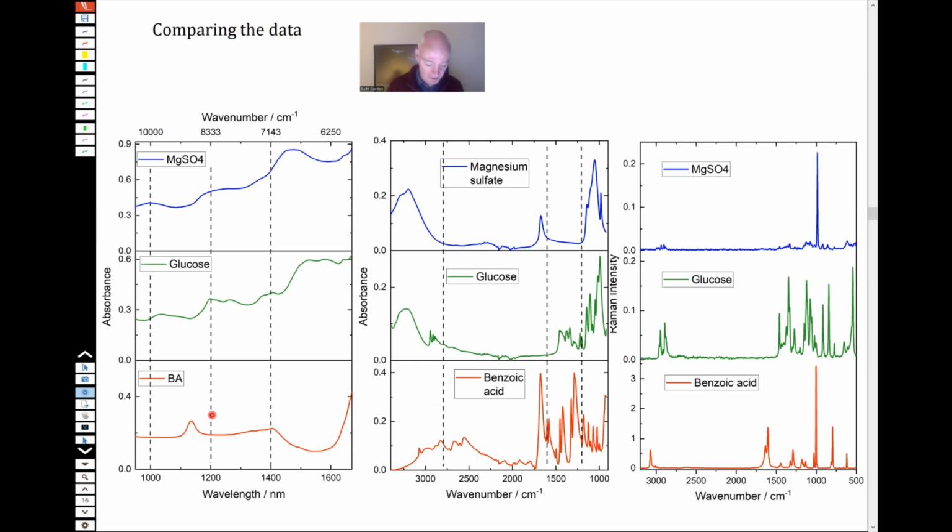So you're using a near-infrared measurement mode, an infrared measurement mode, and a Raman measurement mode. And they allow you to see things because you get very different responses in the different techniques from the materials. So your ability to discern, you can see here, they're not so easy to discern, but over here, they're ridiculously easy to discern.